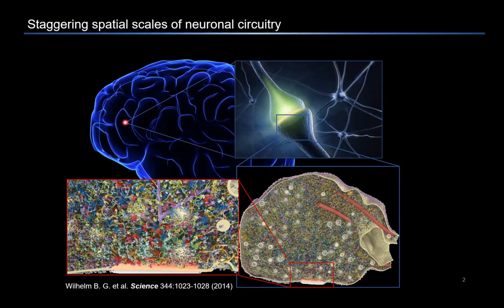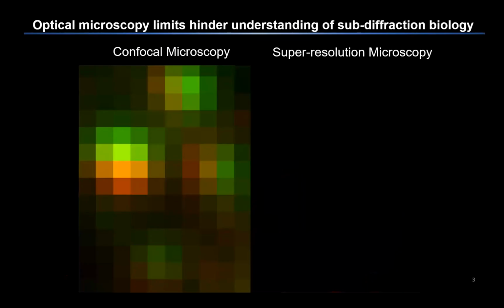It has billions of neurons forming trillions of connections, and those connections we call synapse, which is only like 600 nanometers size objects, and it also packed with thousands of biomolecules of different kinds. So in reality, this is really hard to image. For example, if you try to use optical microscopy to image it, it will look like this, pixelated patches, right?